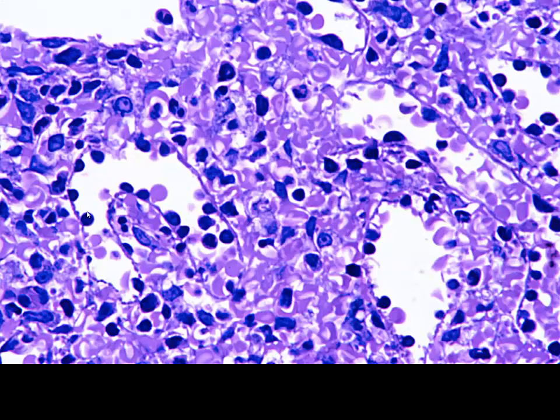Now, this is a neat high magnification slide showing those splenic sinuses, or venous sinuses. We can see some of our endothelial cells lining these, our stave cells. These are the nuclei. But here we can see again that teardrop-shaped red blood cell, and you can see that this is squeezing out of the sinus. There you can see one that's squeezing out.